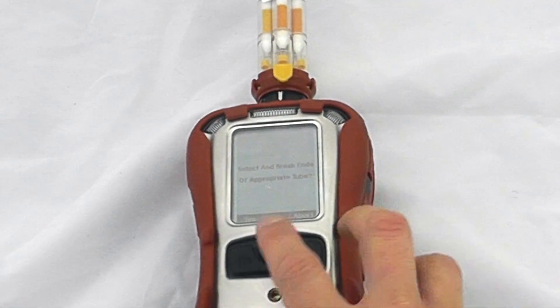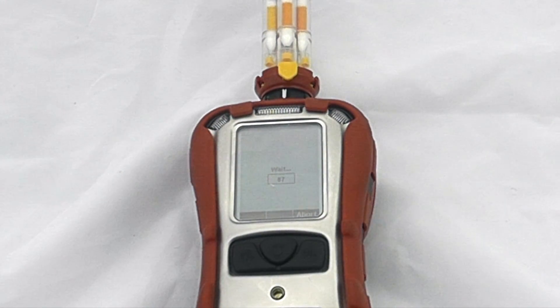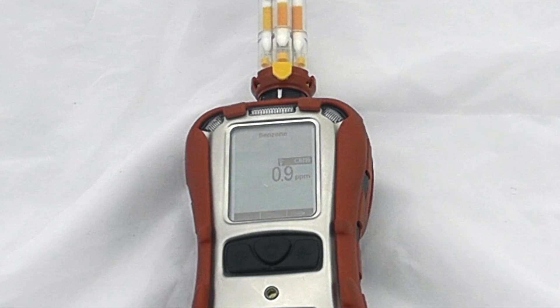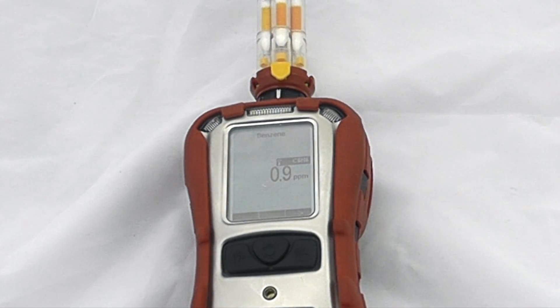To begin the measurement, hit yes and then it's a 90-second countdown on your benzene measurement. At the end of 90 seconds — or dependent on the temperature of the instrument it will alter the sample time required — it will then give us a benzene-specific measurement. We can see our benzene sample has now been taken and we have 0.9 ppm benzene in the current sample.